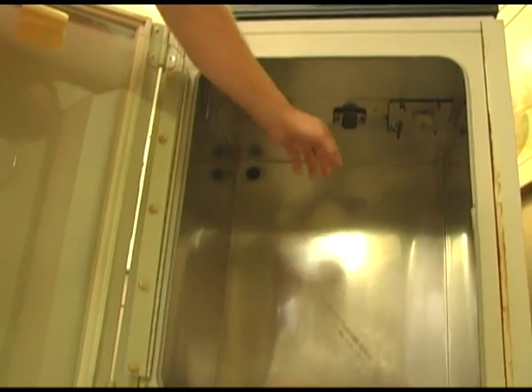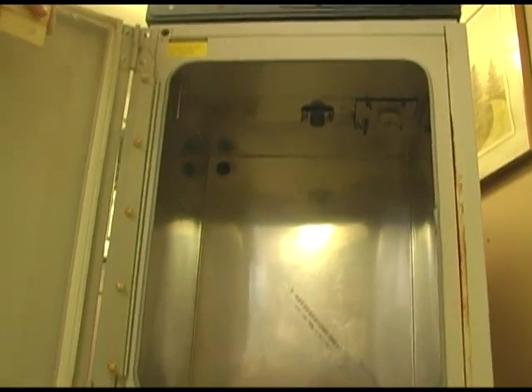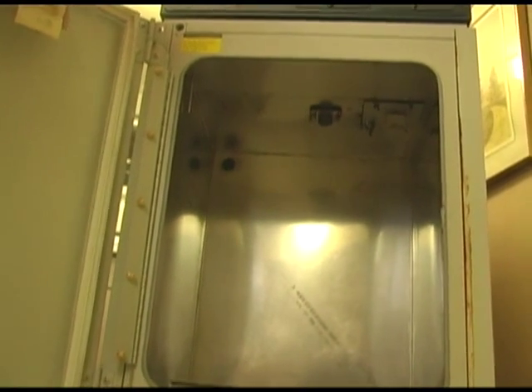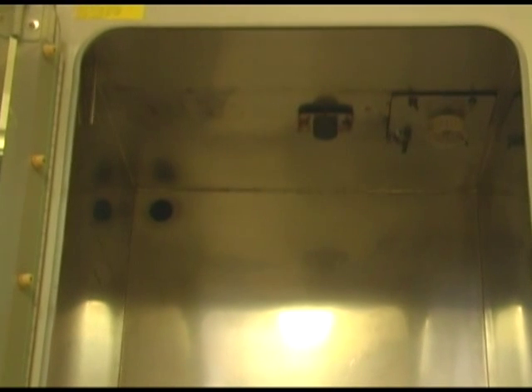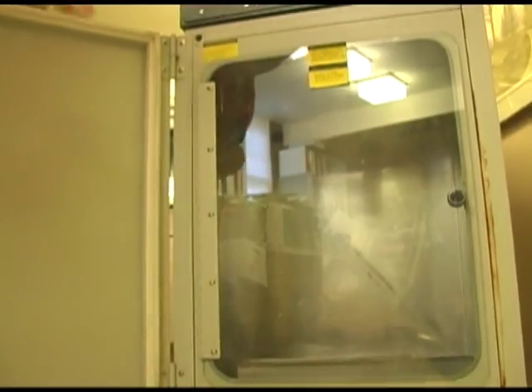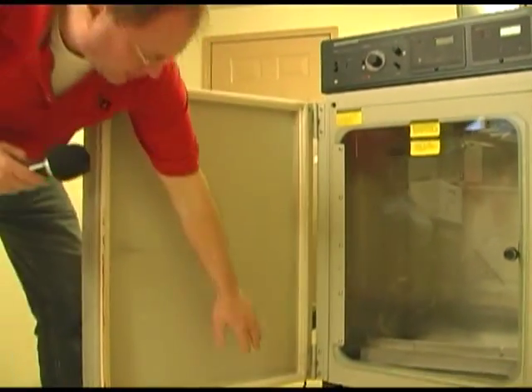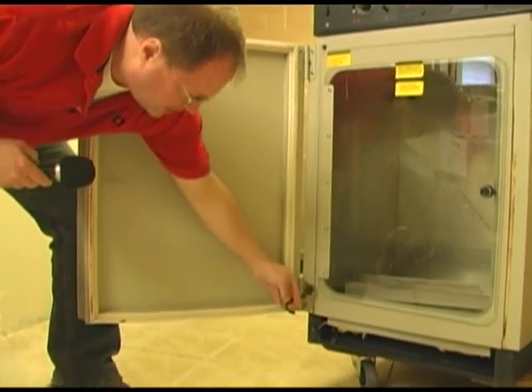There are generally two types of CO2 detectors: thermal and infrared. The thermal is what you're viewing here. If it were an infrared, you would see two LEDs — those LEDs indicate that the CO2 sensor is working. The outer door on this particular unit, and most of them, is heated.